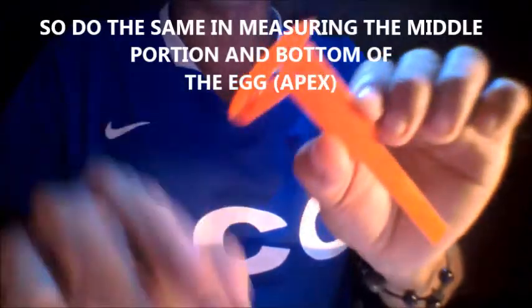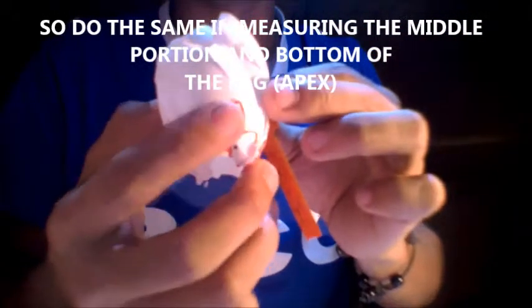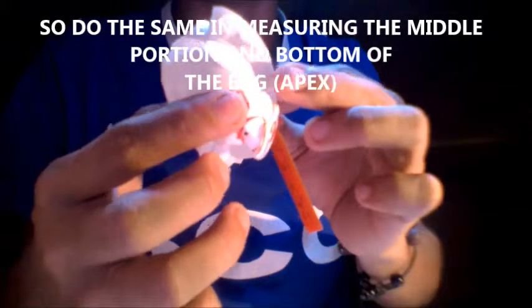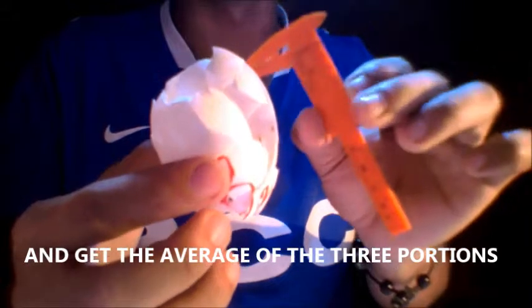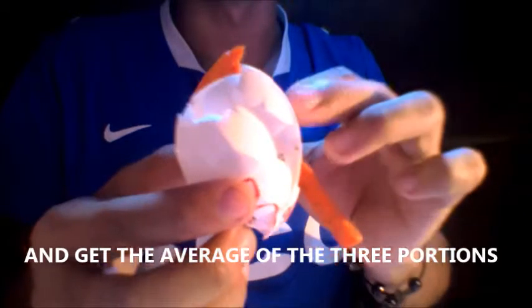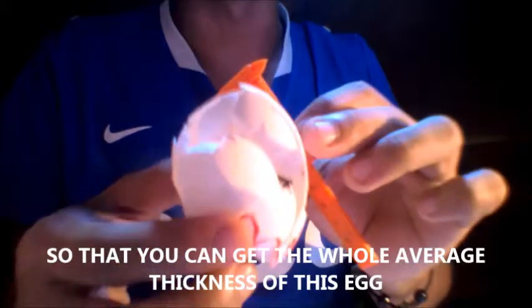Do the same when measuring the middle portion and the bottom, or the apex. Then get the average of the 3 portions so that you can get the whole average thickness of the egg.